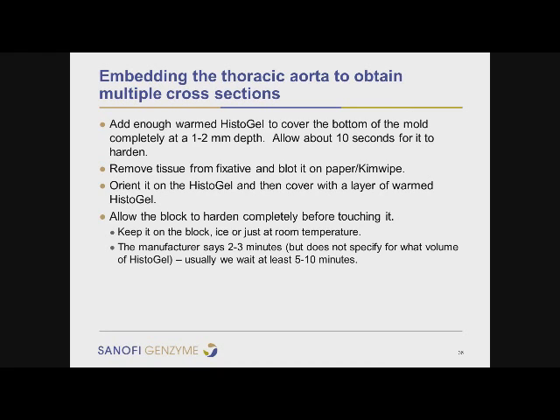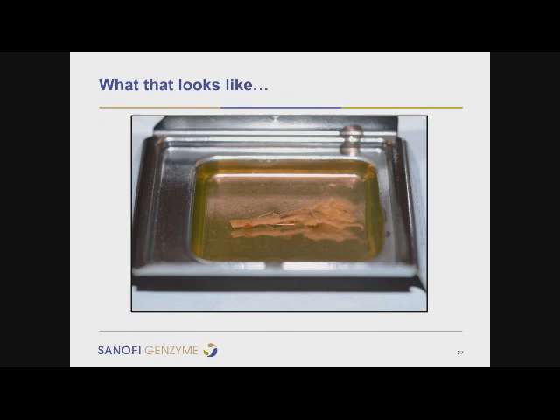That is, by keeping it on that aluminum block. You could also use ice or just do it at room temperature. The manufacturer says to leave it for 2 to 3 minutes, but it doesn't specify what volume or what temperature. I usually try to wait at least 5 to 10 minutes.